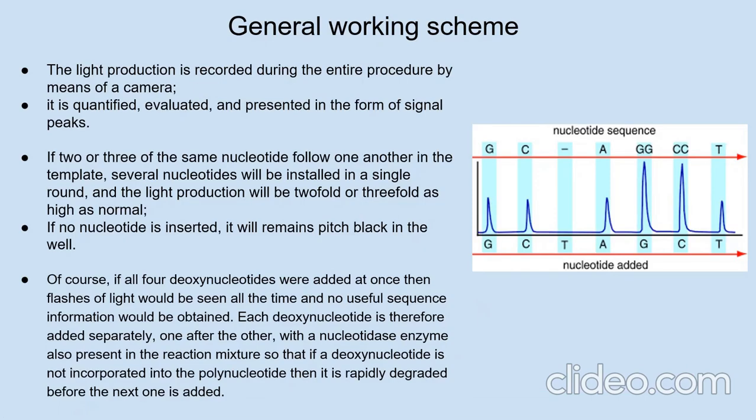dNTPs. Now, moving ahead on the general working scheme, the light emission is recorded during the entire procedure by means of a camera. It is quantified, evaluated, and presented in the form of signal peaks, which we can see in this picture over here.